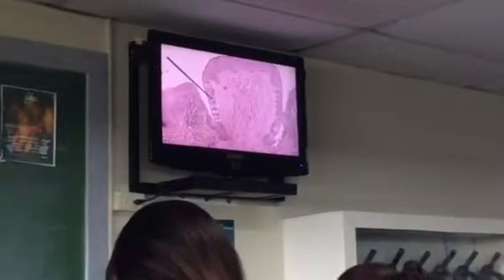So again, this is an example of your circumvallate because we find the taste buds at the sides, and it is usually found embedded. The circumvallate is usually embedded. And there you go, you see your taste buds at the sides. Let's look at this. This is low power. And this is high power.